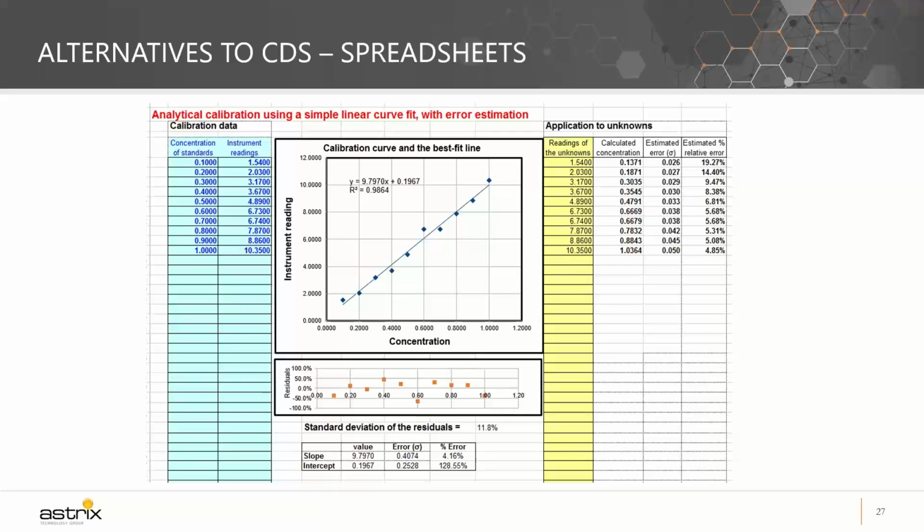Near none. It's hard to lock an Excel spreadsheet in a way that people cannot tamper with it. So it's a very complicated environment to work with. I'm sure many of you are thinking that a case could be made of using validated spreadsheets. That might be true, assuming someone else doesn't unlock the sheets and manipulate calculations, which, you would be surprised, it's incredibly easy to unlock an Excel spreadsheet. A couple of Google searches and you would find answers to that, and you could break that easily.